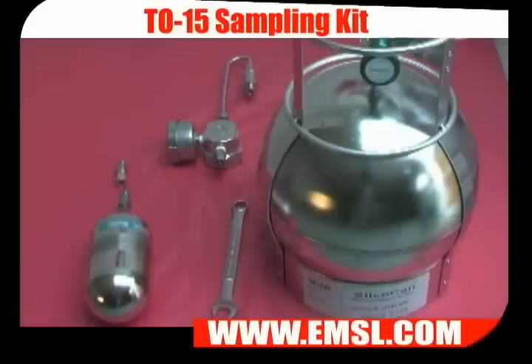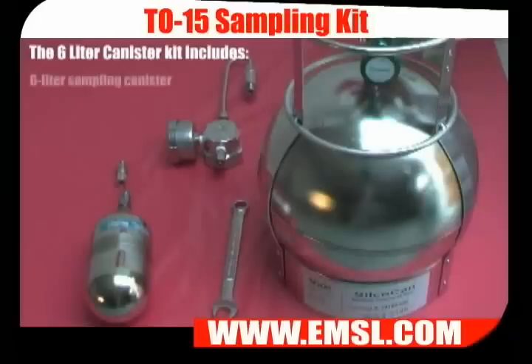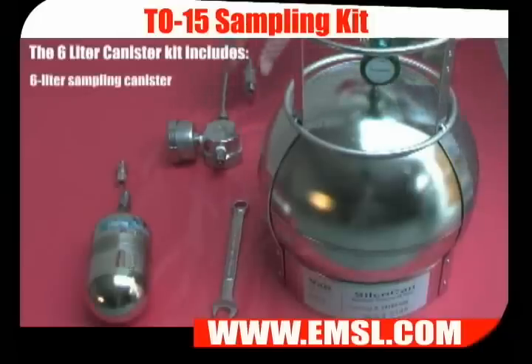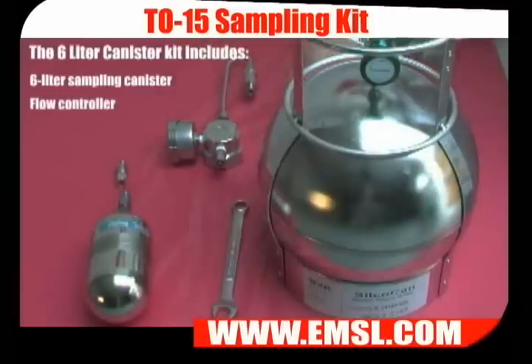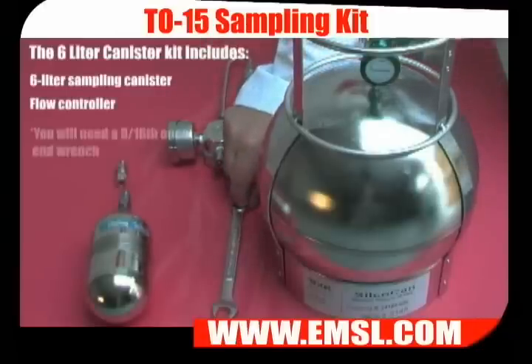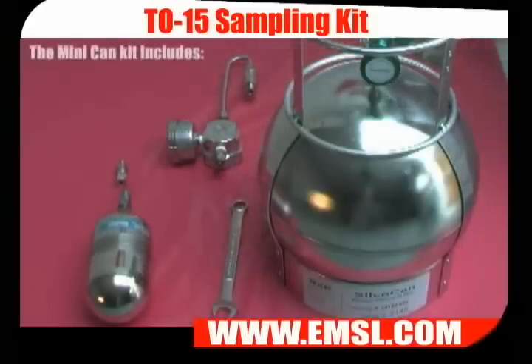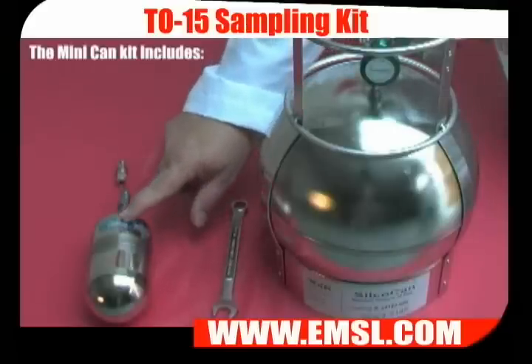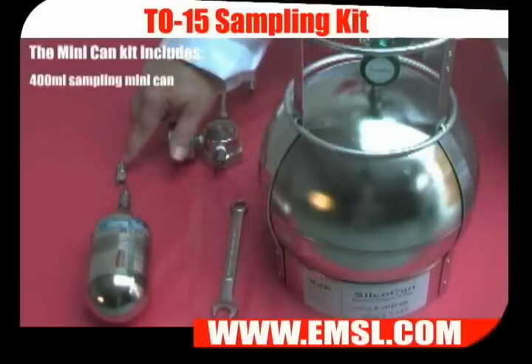Depending on your application, your kit will contain the following items: a six-liter sampling canister and a flow controller. You'll also need to have a nine-sixteenths opening wrench. For mini-can sampling, your kit will contain a 400-milliliter mini-can and a sampling adapter.